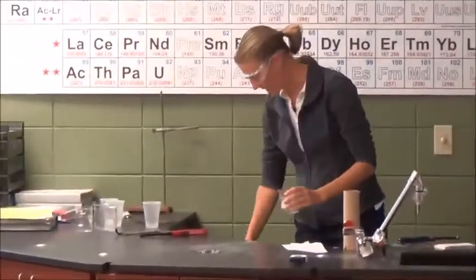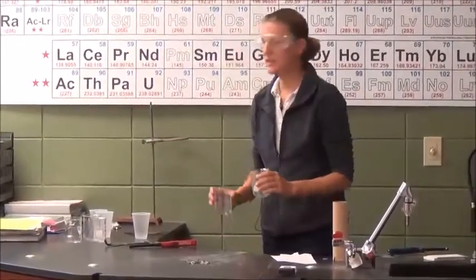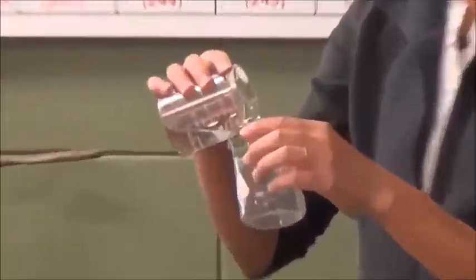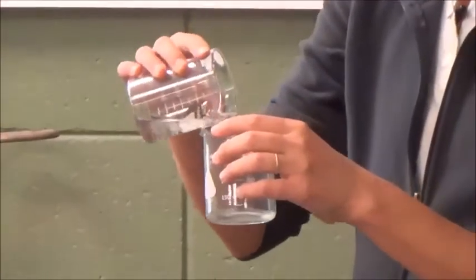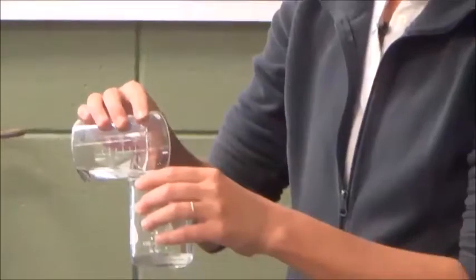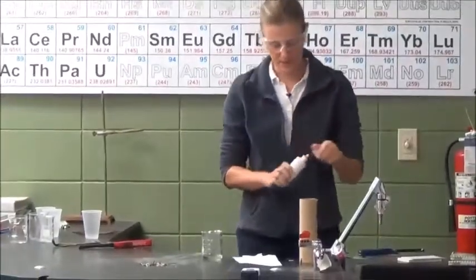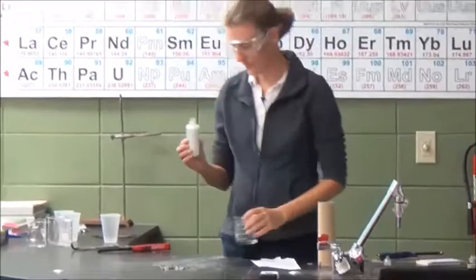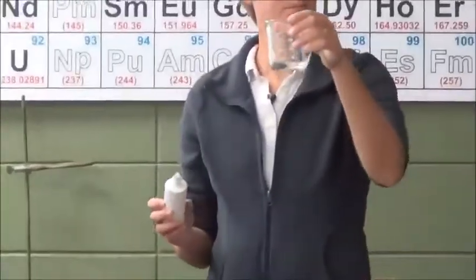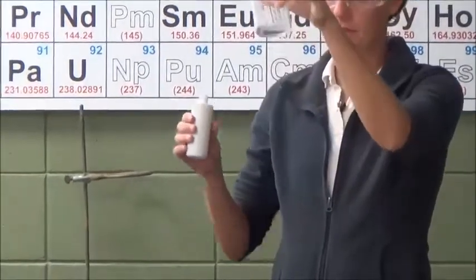Silver nitrate and potassium iodide. Which may say KCl on your sheet, but we're going to use potassium iodide. I just got a little bit of it here, which I got to save. And silver nitrate is actually expensive. It does have silver atoms in it, which are somewhat rare. So here's some silver nitrate. Here's some KI. They're both pretty much clear liquids.